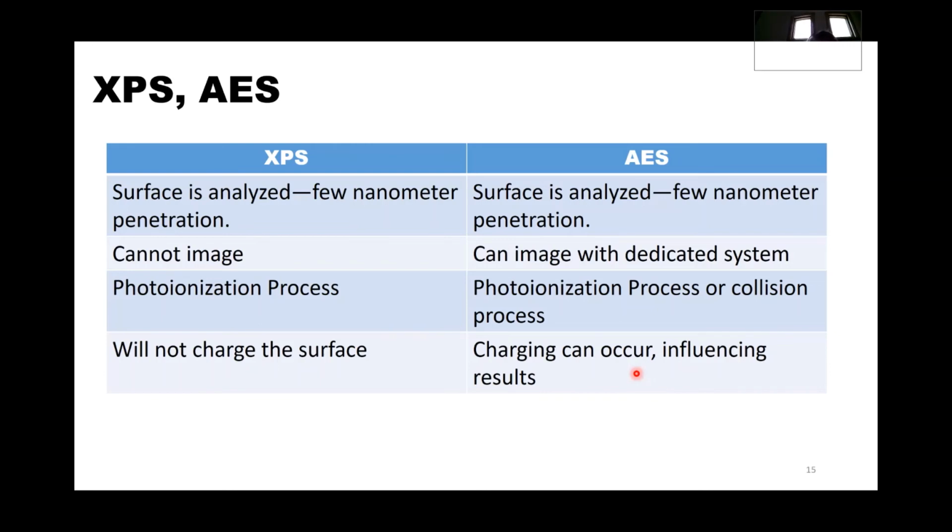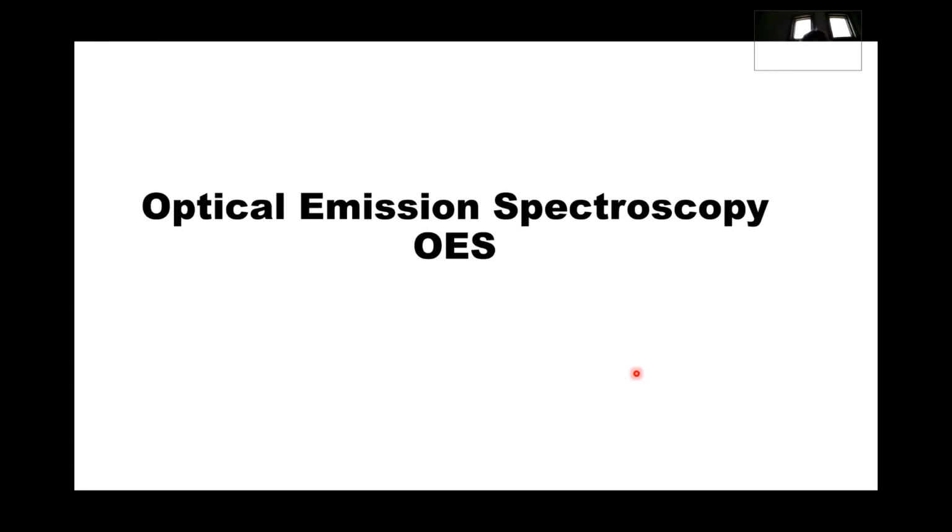Let's move on to our third spectroscopy technique I said we were going to talk about today. I'm giving this lecture in the dark. I've lost power. But let us move on to optical emission spectroscopy, OES.